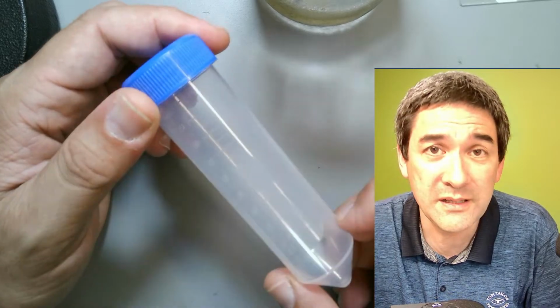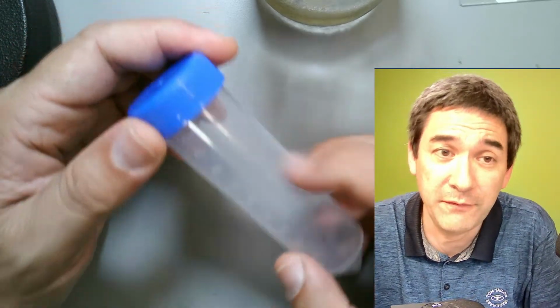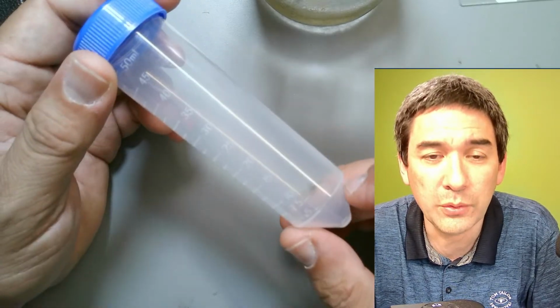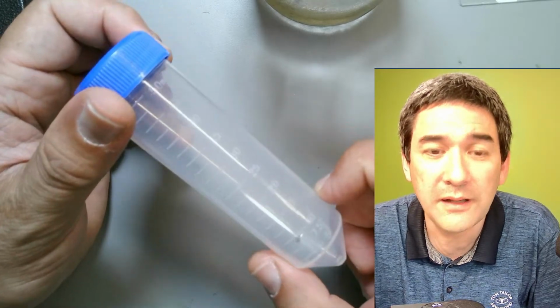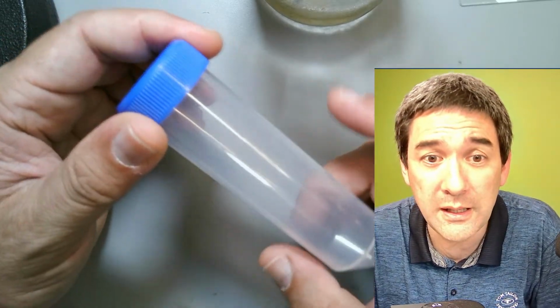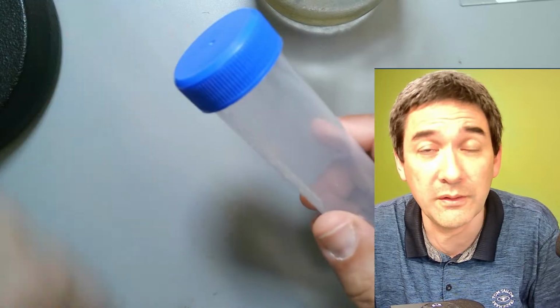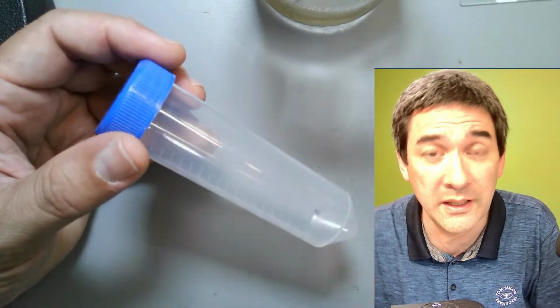That's a mistake that I made some time ago. I collected water samples and filled them all the way to the top. No, not a good idea. If you only keep a small amount of water with a lot of air in the tube, then honestly it was able to be stored for days with no problem. But as soon as you fill it up and put a lid on it, it's going to start smelling bad, like sulfur, because it starts to go anaerobic and everything is going to die off.